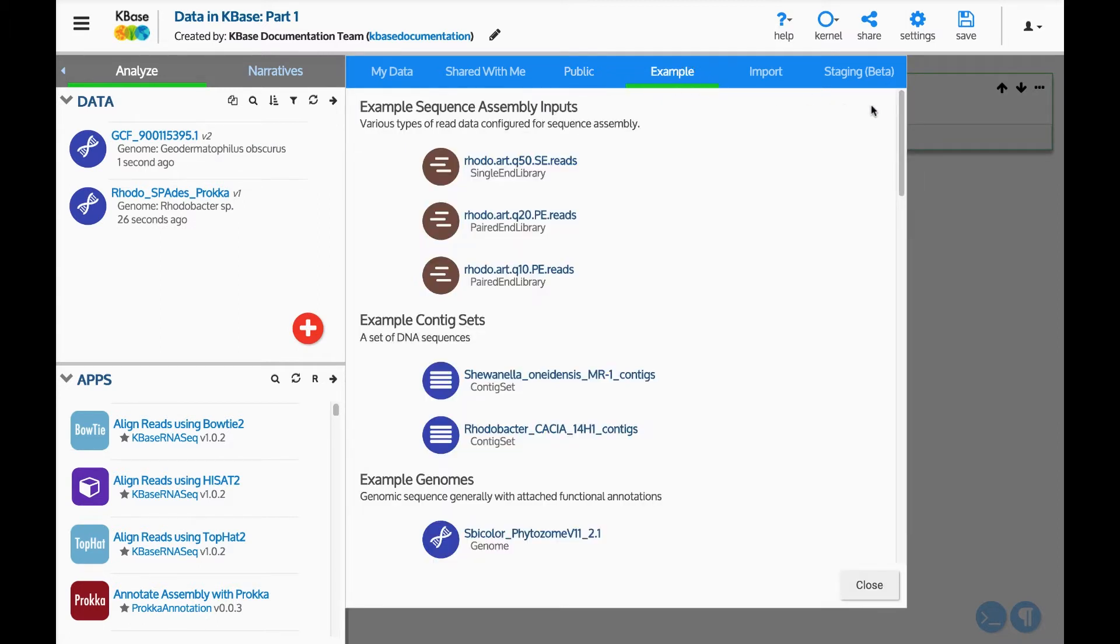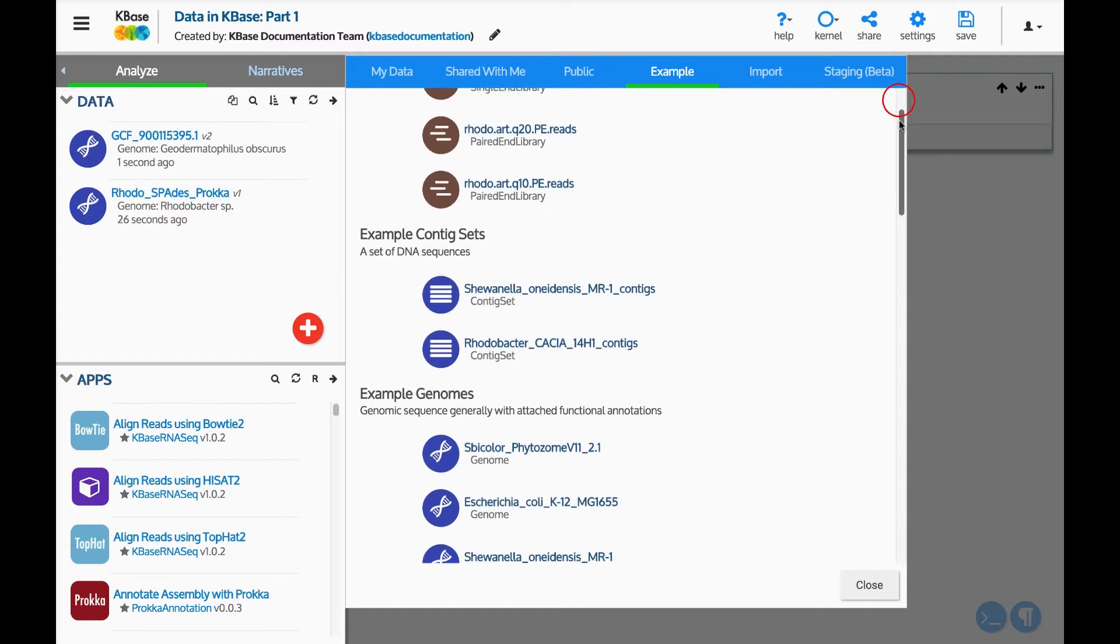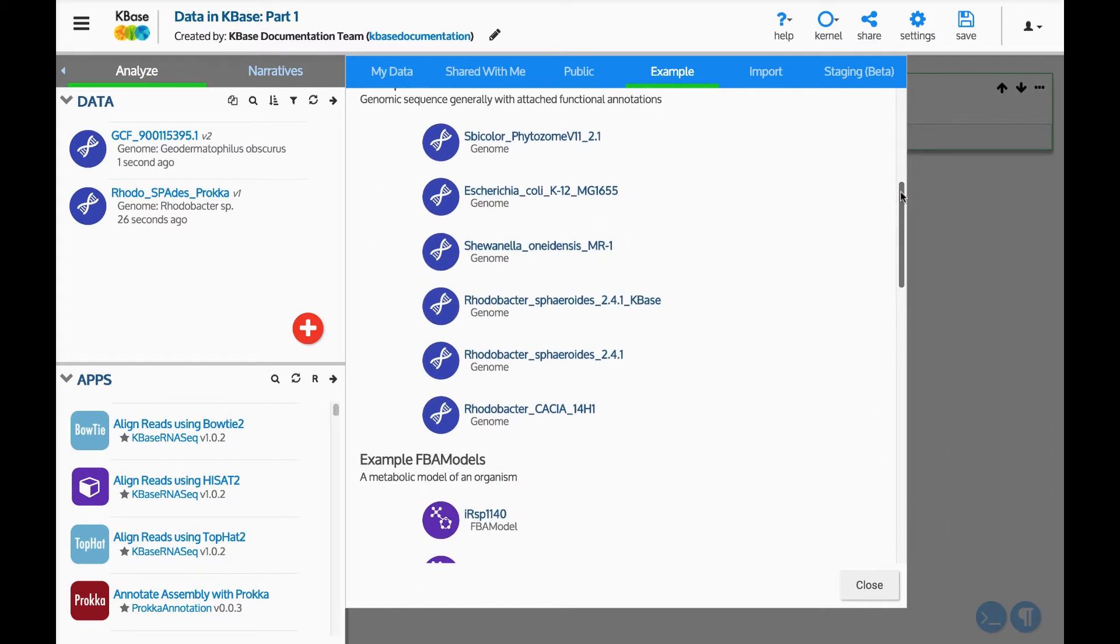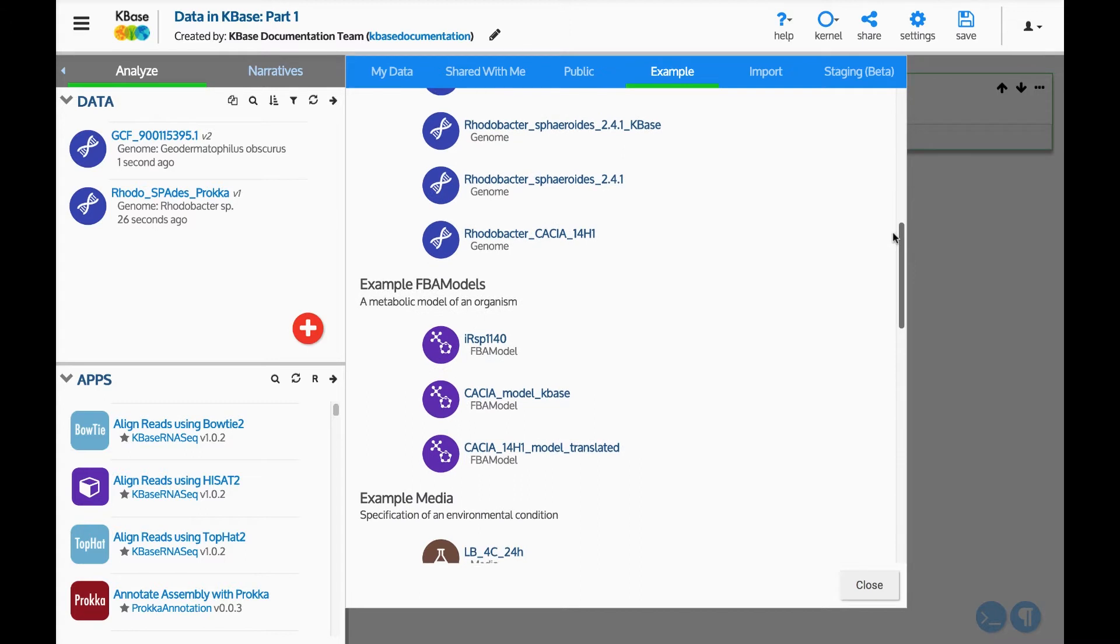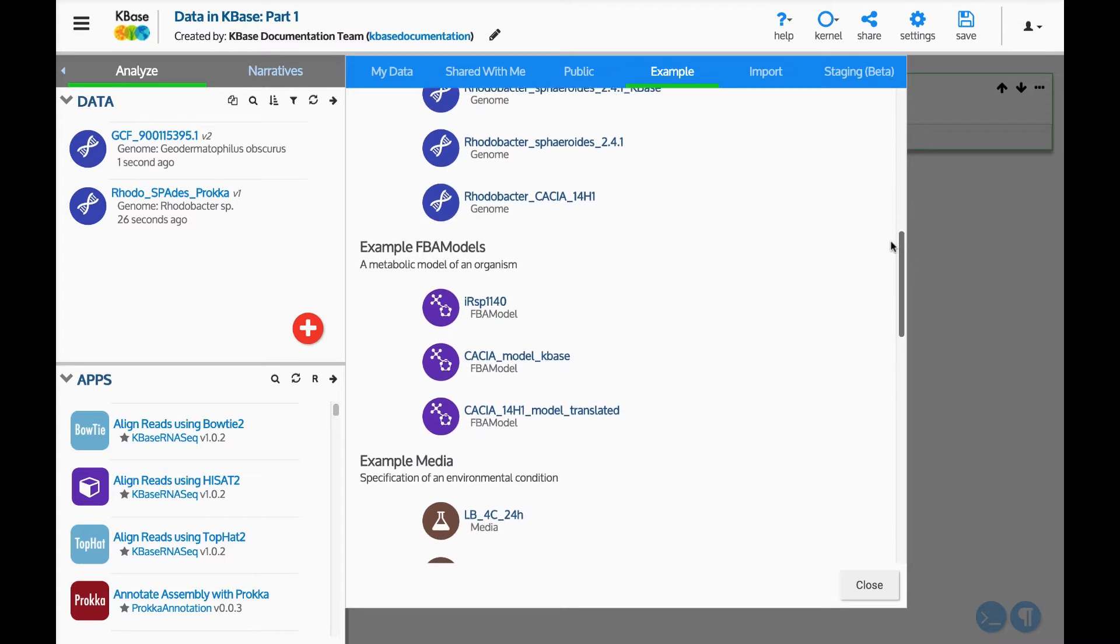Now take a look at the example data. The example tab contains sample data that can be used to demonstrate KBase analysis tools.